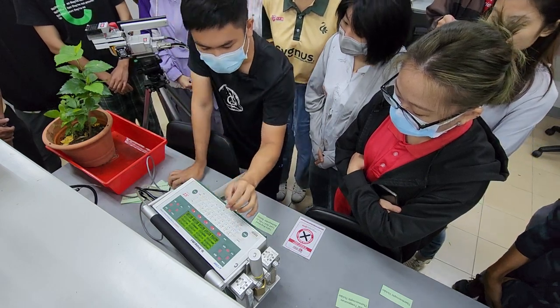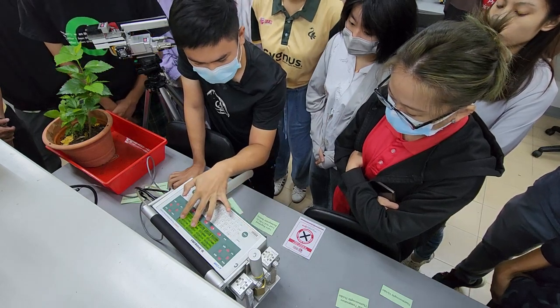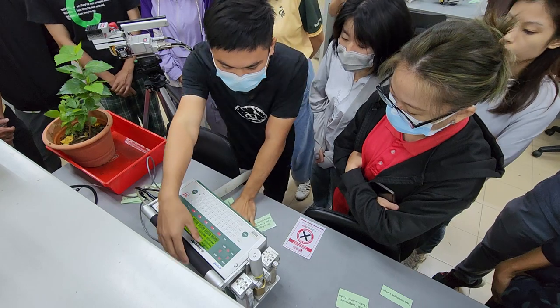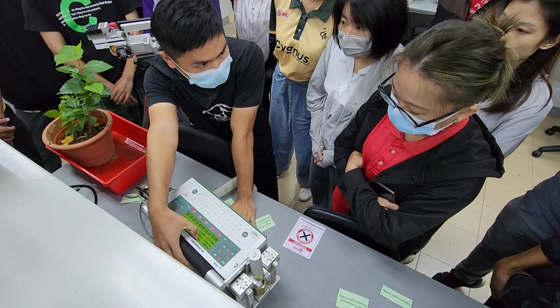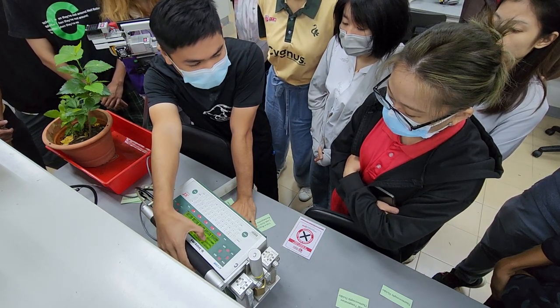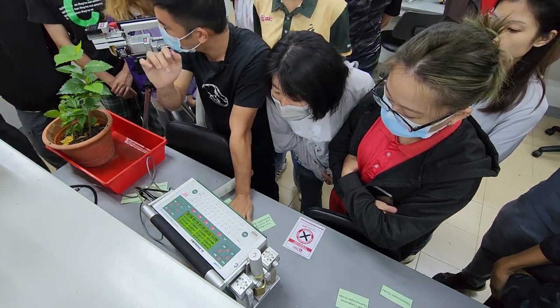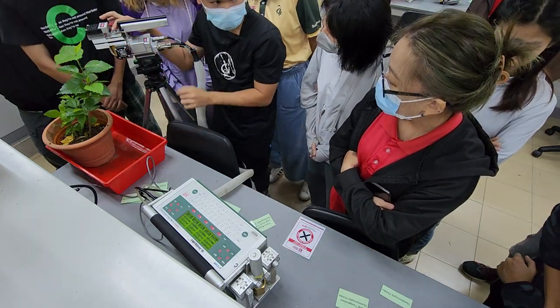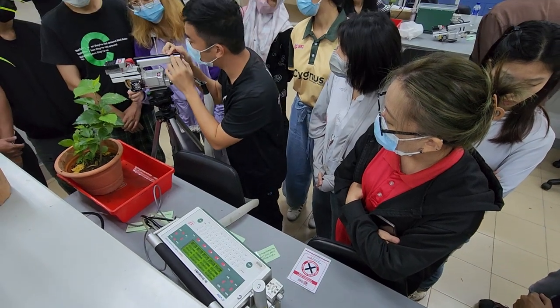So first you need to look at the CO2, and also the H2O. So how do we calibrate it? This I reference and S, it should be almost the same. We can tolerate a delta CO2 of less than 2. Now it's about 8. So first what you can do is adjust this knob here. Maybe someone can blow it. Just blow.